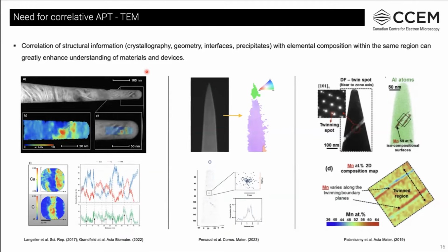example, it's human bone, and TEM reveals a very detailed structure. Atom probe complements this by allowing us to map the chemistry of these features, seen here as alternating mineral and collagen-enriched bands based on enriched calcium and carbon concentrations. This mapping also shows the co-localization of sodium with organic components, as well as at interfaces.